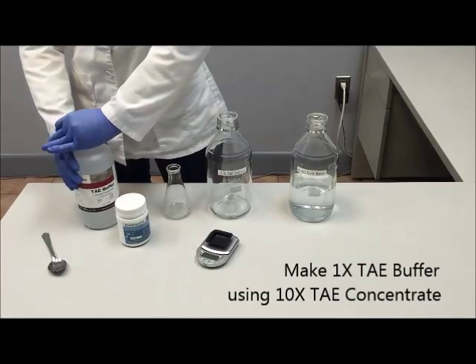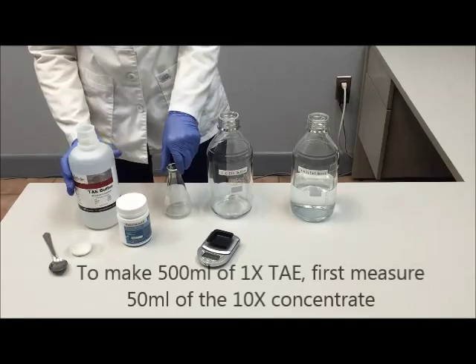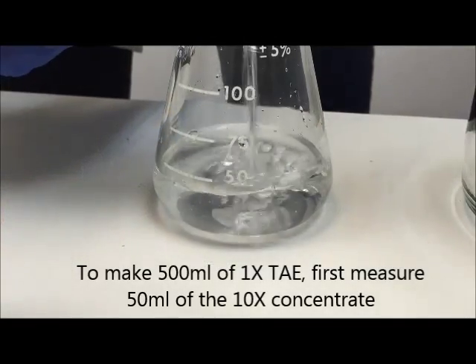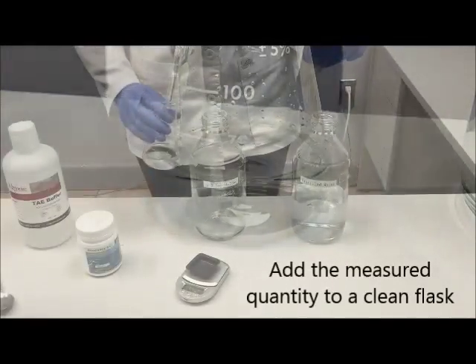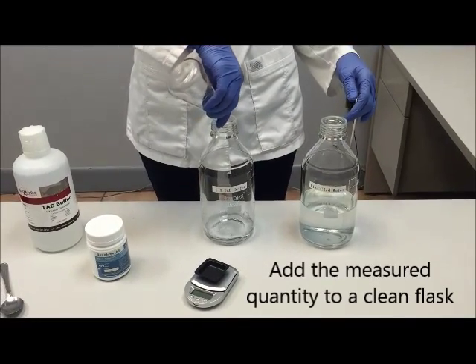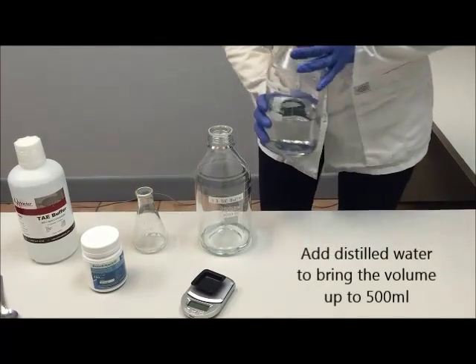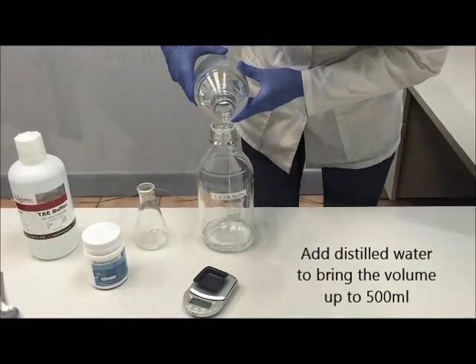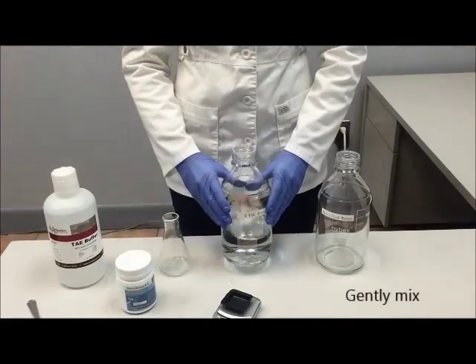Our first step is to make 1x TAE buffer using our 10x TAE concentrate. To make 500 ml of 1x TAE, first measure 50 ml of the 10x concentrate, add this measured quantity to a clean flask, then bring the volume up to 500 ml using distilled water. Then gently mix the solution.